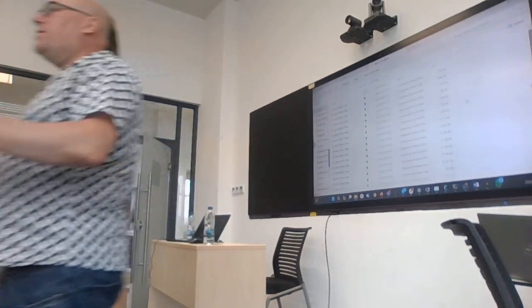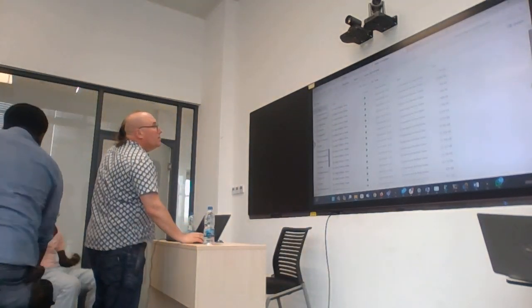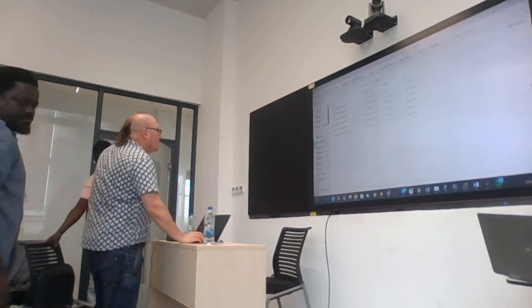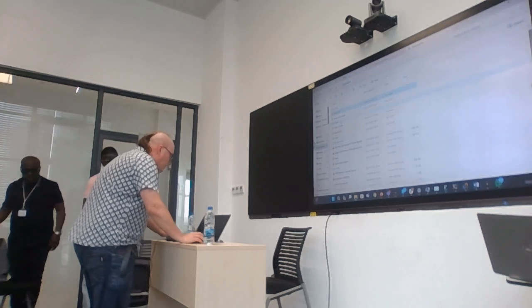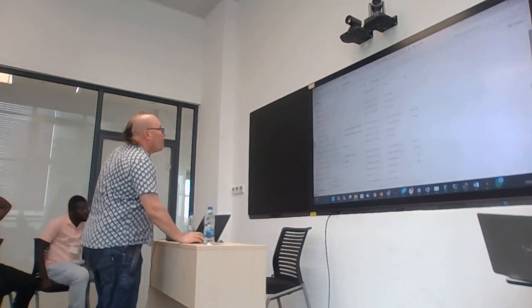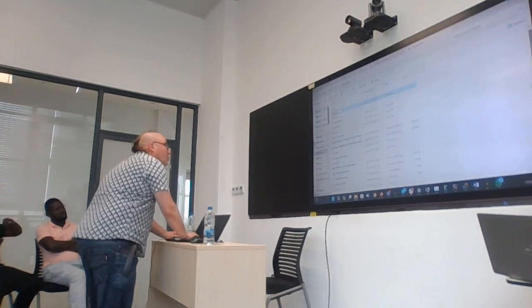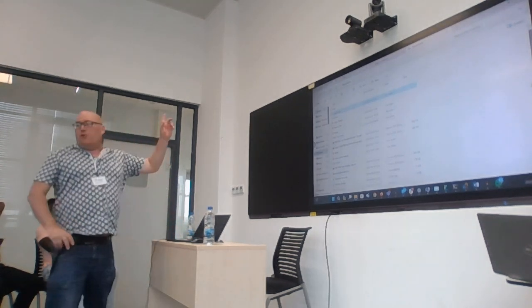For our first run, I want us to choose one sample, okay? So I'm going to go into my computer, into my documents, I'm going to delete this, and I'm going to make a new folder. I'm going to call it Mpox_1. So now I have a new folder called Mpox1.